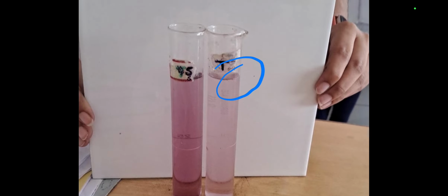solution. So you may observe the color comparison. Here, if the test is less intense than your standard, the test passes the limit test. Suppose the test is more intense than your standard solution, then the test fails the limit test for iron. Thank you.